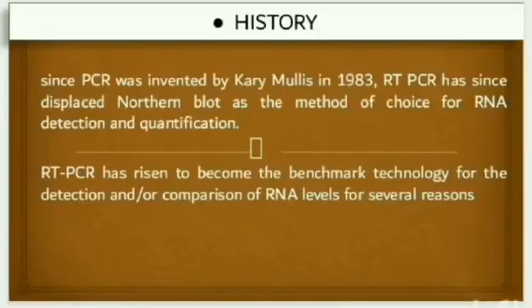Since PCR was invented by Kary Mullis in 1983, RT-PCR has since displaced Northern blot as the method of choice for RNA detection and quantification. RT-PCR has risen to become the benchmark technology for the detection and/or comparison of RNA levels for several reasons.